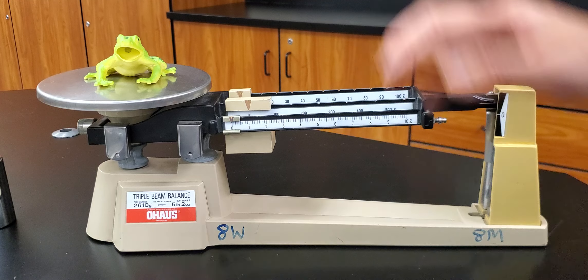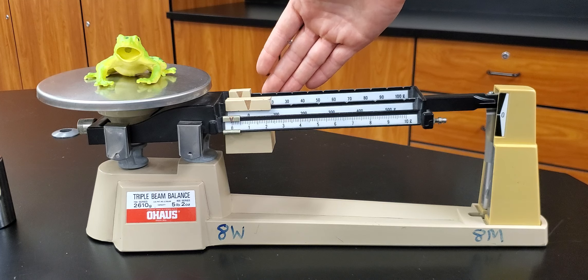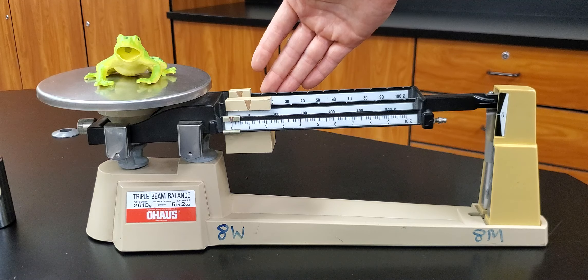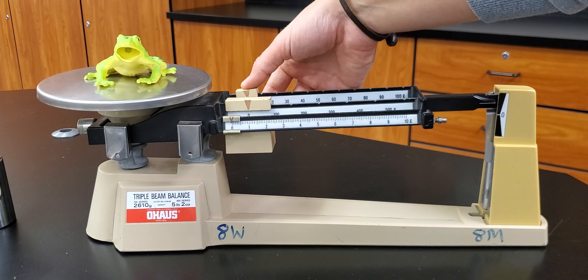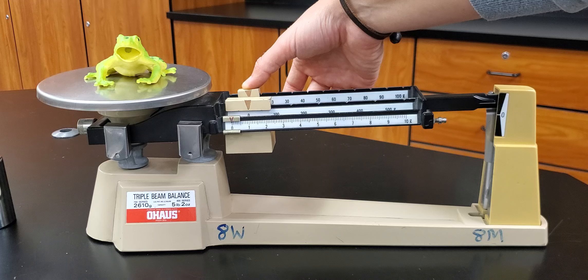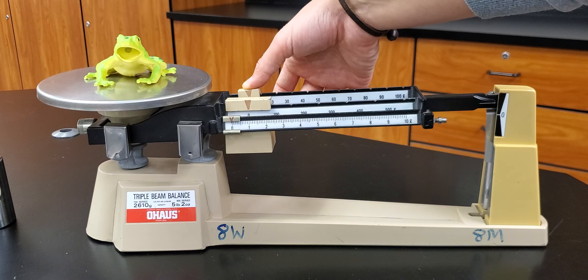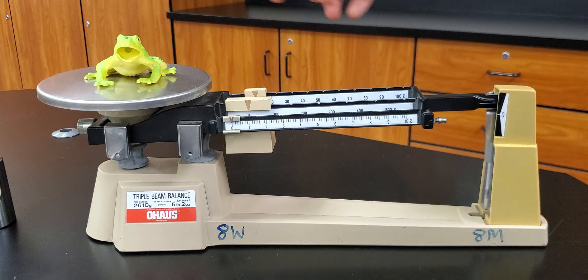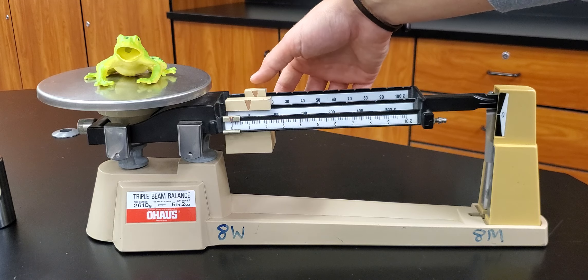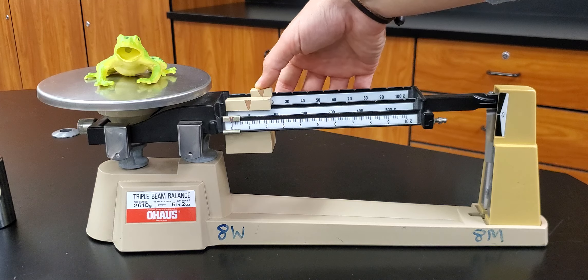Now it's less than 100 grams so I need to move to the back beam, my tens gram or my tens place spot. So I'm gonna move my slider down and again we've got grooves back here so I'm gonna make sure it clicks into the 10 gram groove. Alright, and my arm is still up so that means that my frog has a mass of more than 10 grams. So I'm gonna keep going.